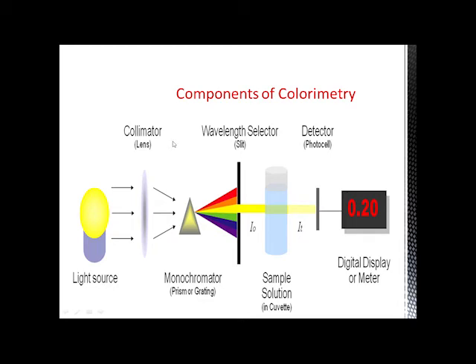This filter selects a sufficiently narrow band. The filter absorbs the light of unwanted wavelengths and allows only monochromatic light to pass through the solution.